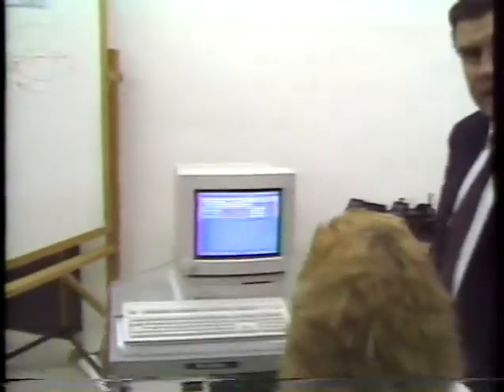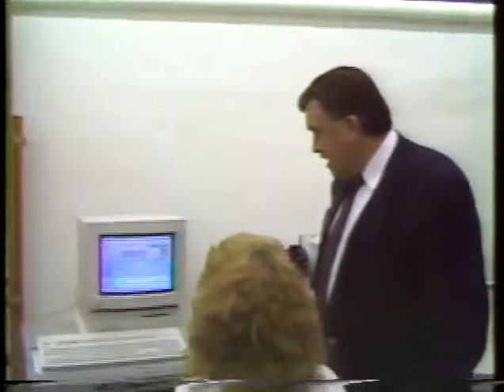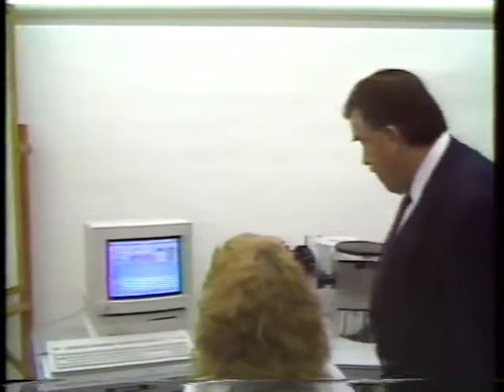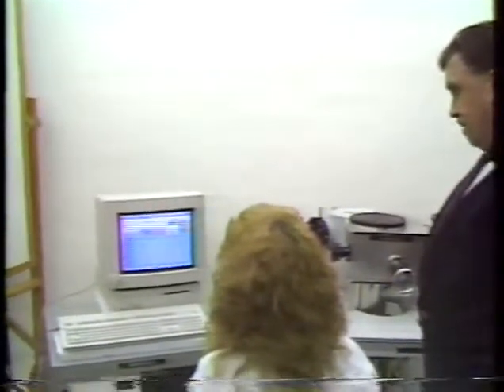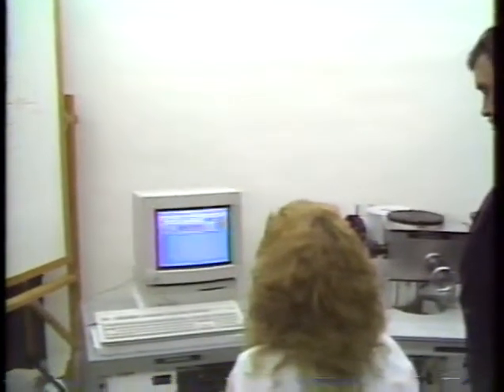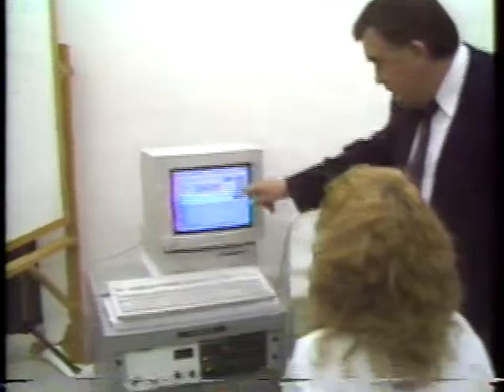While all this is happening, we are storing all this data for treating a sample with the proper baseline reference. Now we see these slight steps in here.